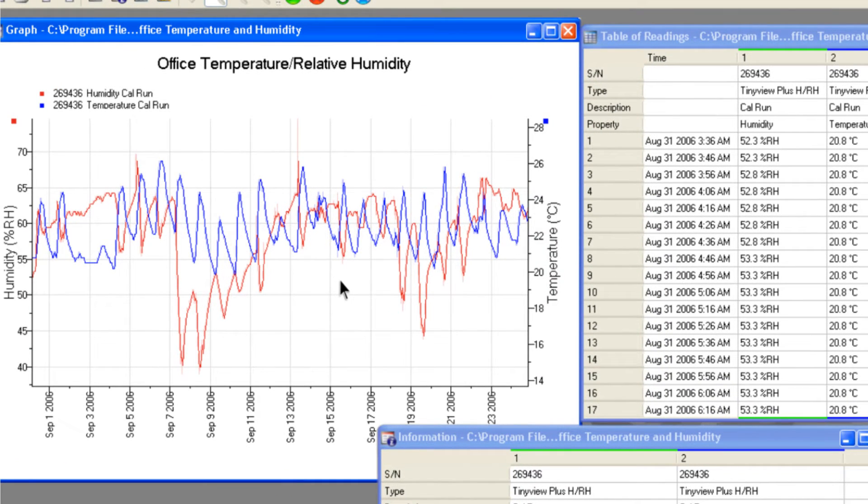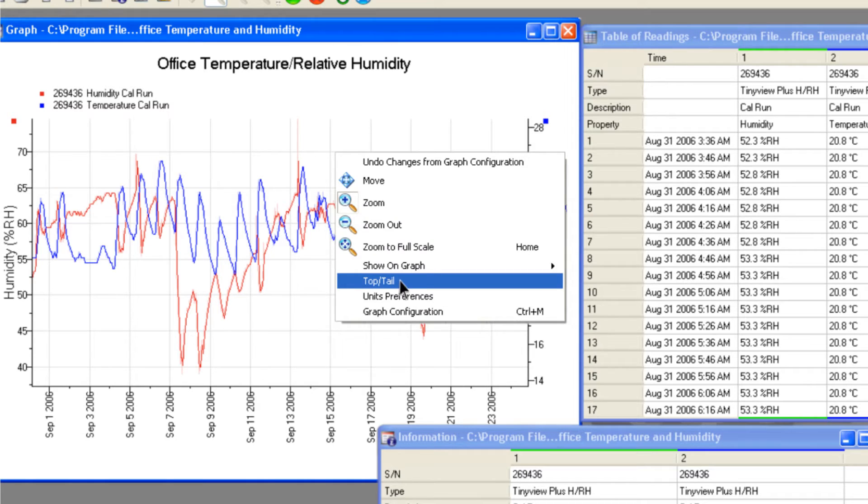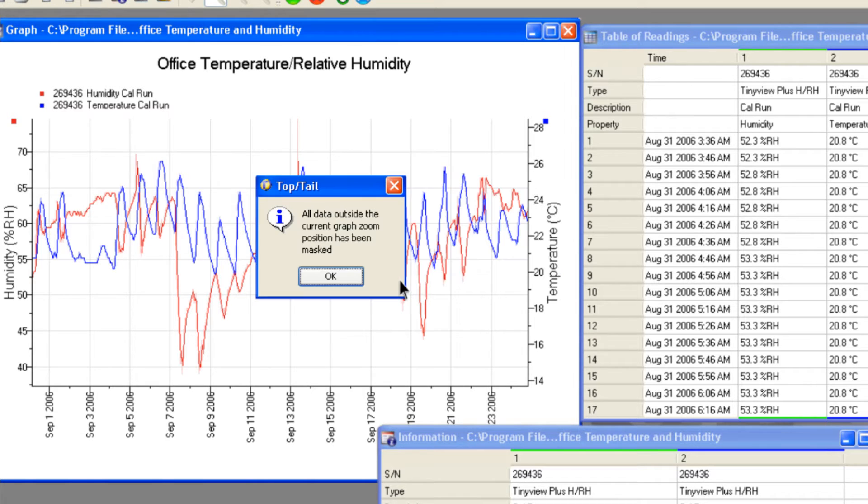If you are only interested in viewing a certain section of the data, you can mask the rest using the top and tail tool.